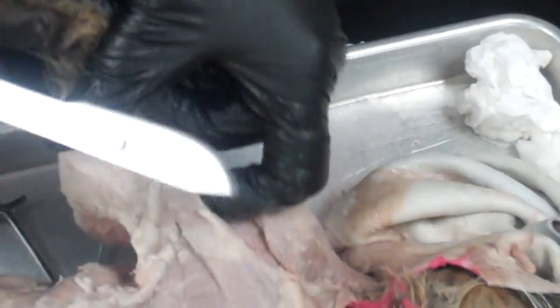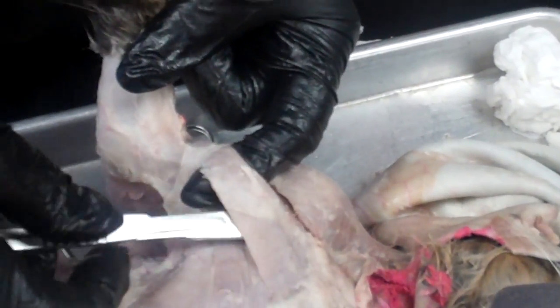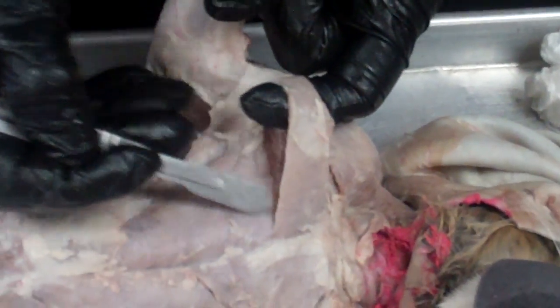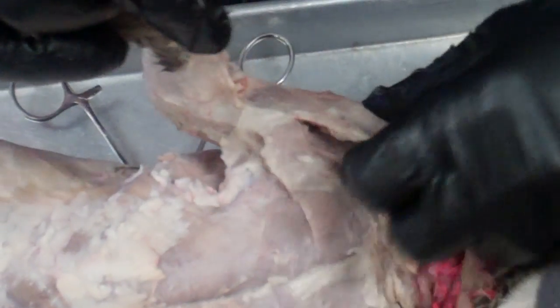The pecto-antibrachialis is a thin little strap of a muscle, and the very large pectoralis major is underneath it, so you need to work at separating that from the pectoralis major. There's the pecto-antibrachialis — once you've found that, you can work toward the clavodeltoid muscle, which is also sitting on top of the pectoralis major.